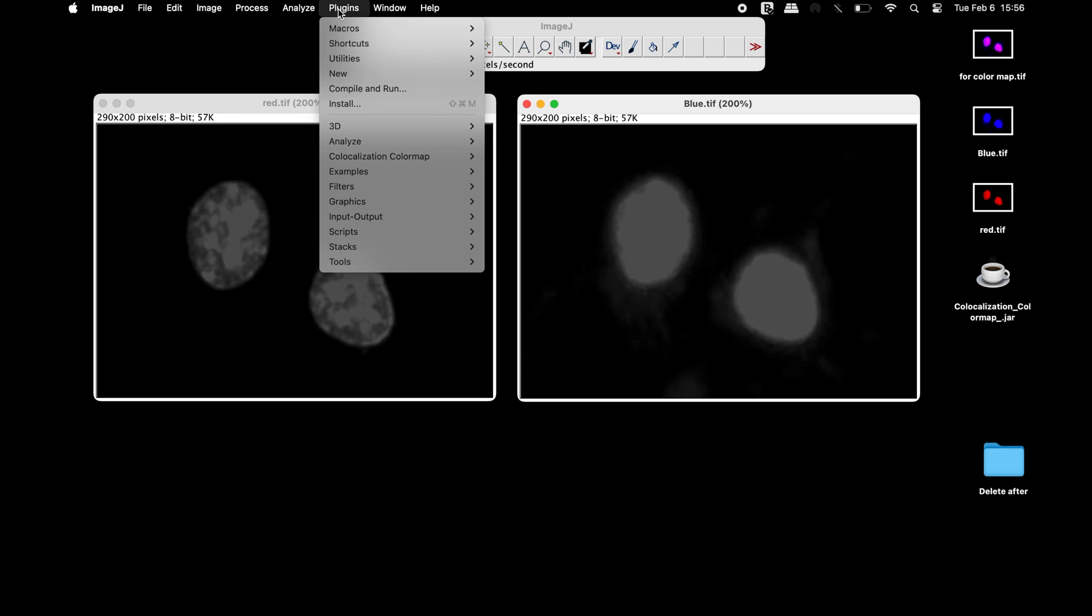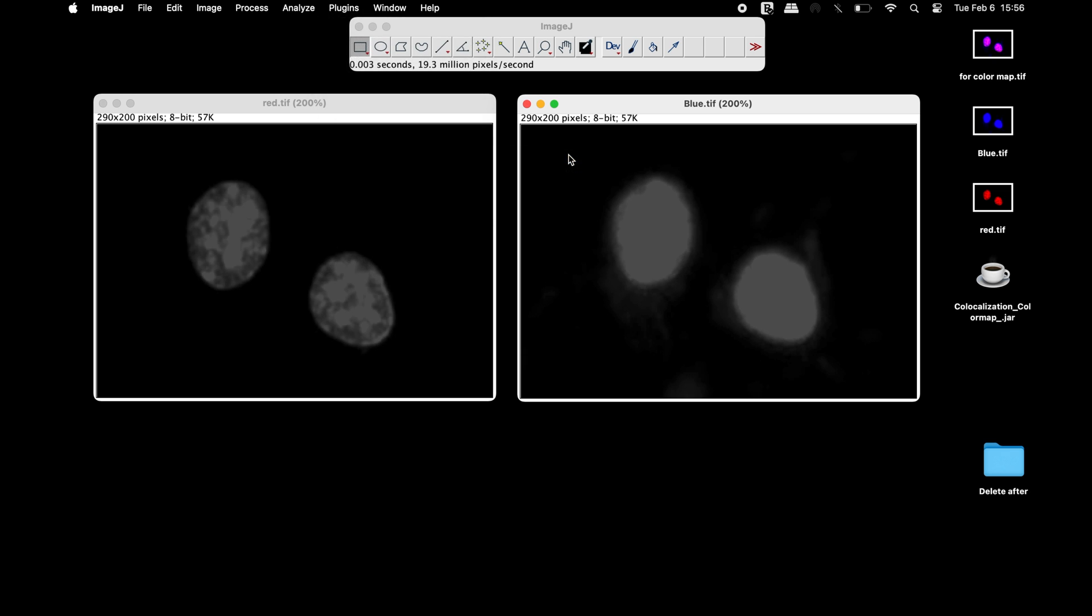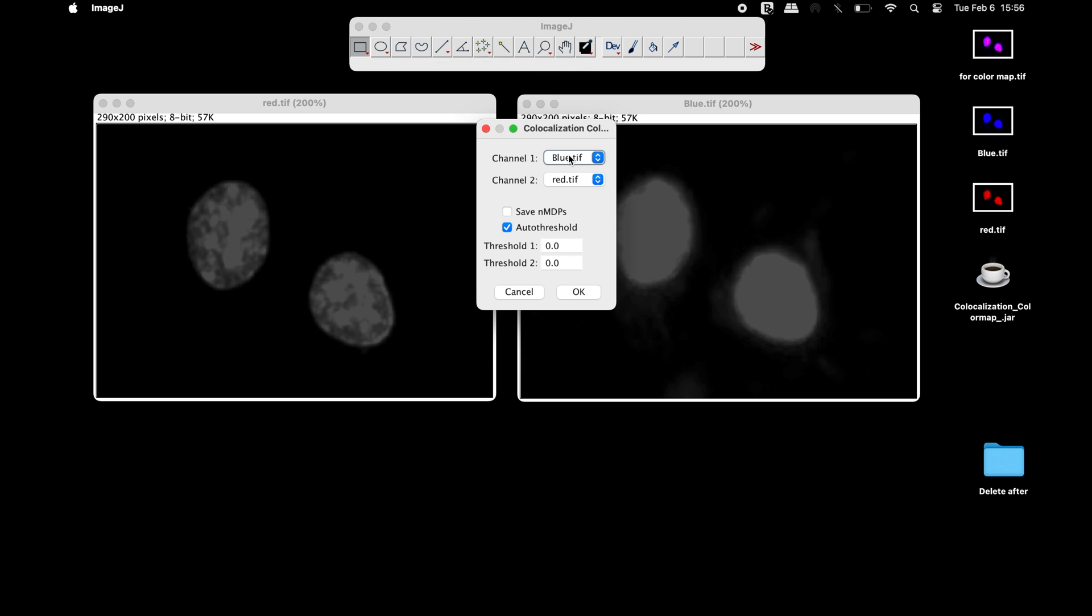Next, head to plugins co-localization color map and select co-localization. In the co-localization color map window, select the images for channel 1 and channel 2.